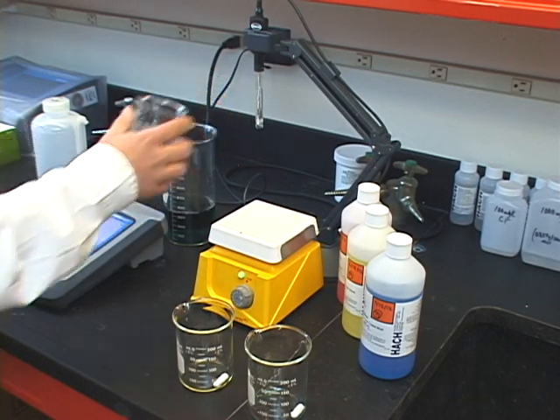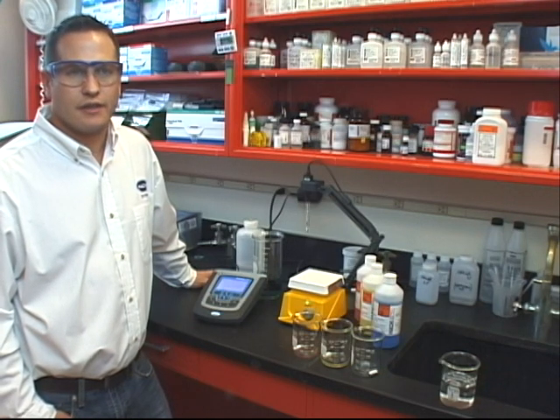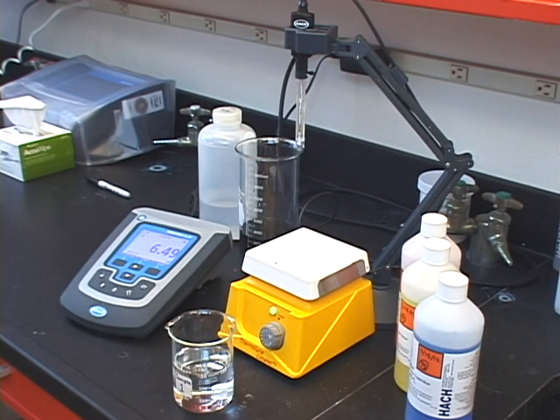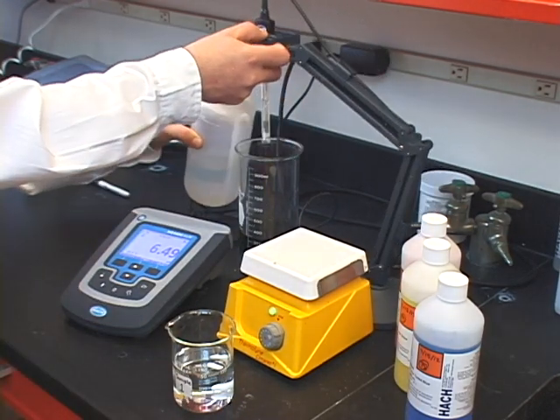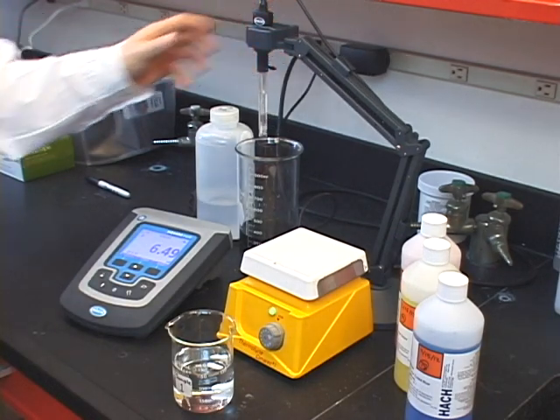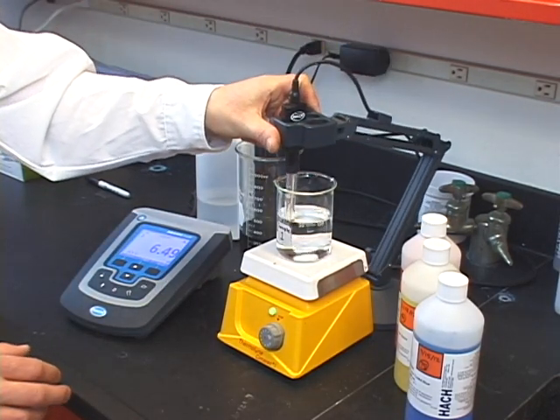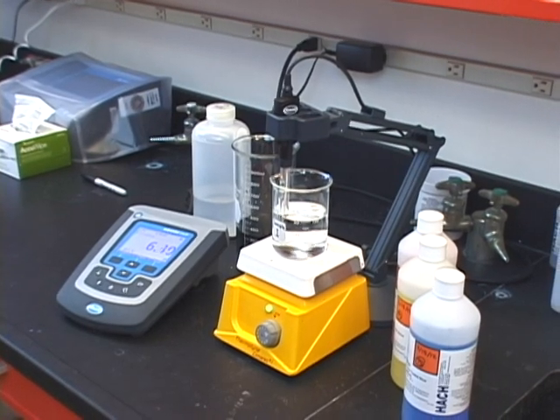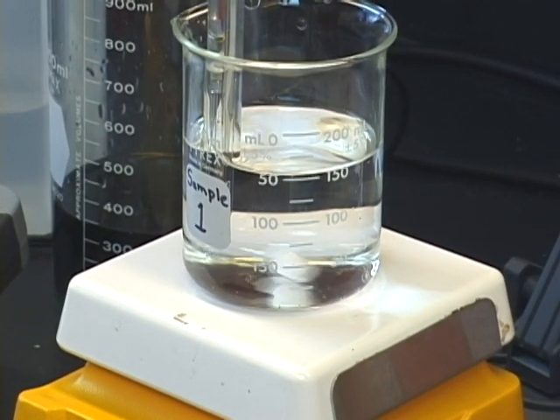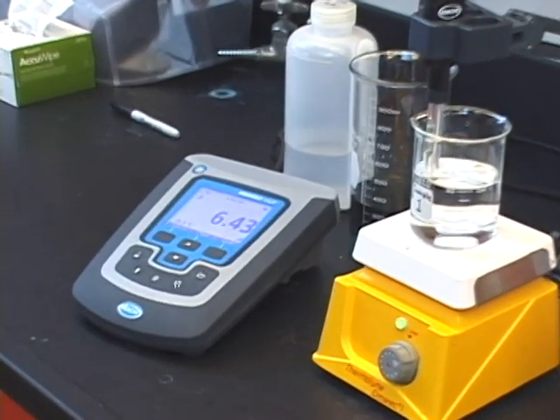Now that you have calibrated your meter, it is time to take your measurement. Since you properly calibrated your meter, measuring samples should be easy. Just as with buffers, it is important to always use clean containers to avoid potential contamination of your sample. Place your electrode in the sample and press read on your meter. Some meters have an auto stabilization function, which can help with accuracy. This feature locks in your pH reading once the meter decides that the electrode is at its most stable point. Once the reading is stabilized, your meter will lock the reading on your display for you to record.